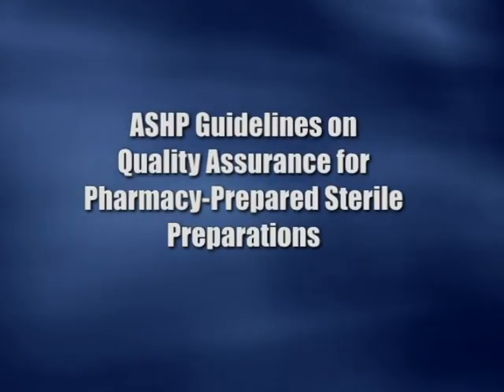It is crucial that you first work through the entire program from beginning to end before focusing on those sections most relevant to the work you do in your environment. For additional information, you are also encouraged to refer to the ASHP Guidelines on Quality Assurance for Pharmacy-Prepared Sterile Preparations. Links to those publications and other valuable resources are located in the back of your workbook. Before going on any further, please take time now to familiarize yourself with the glossary of terms in your workbook.